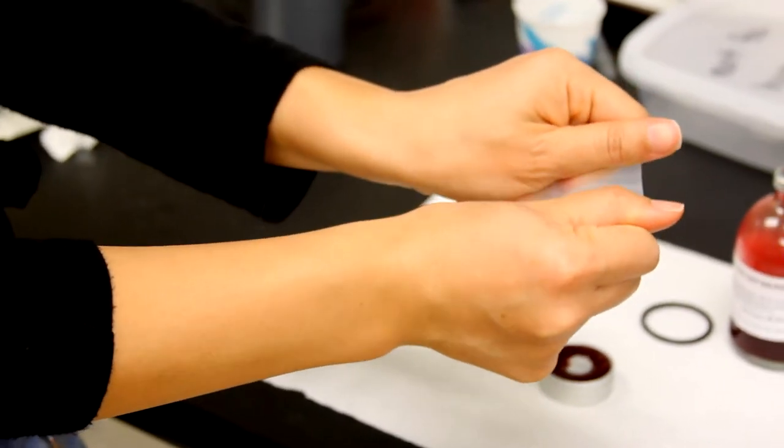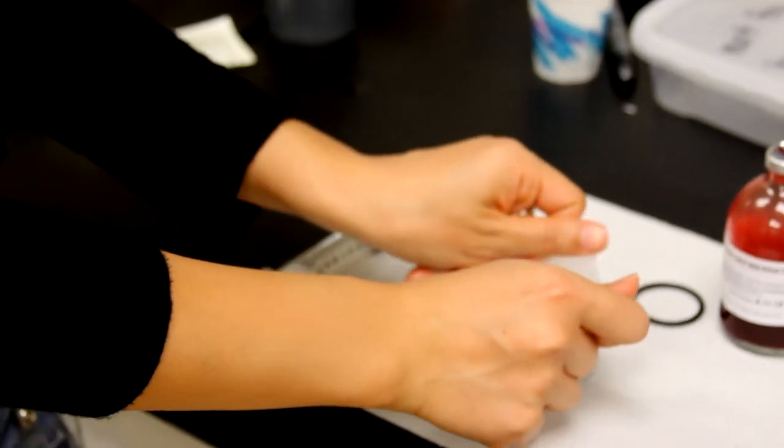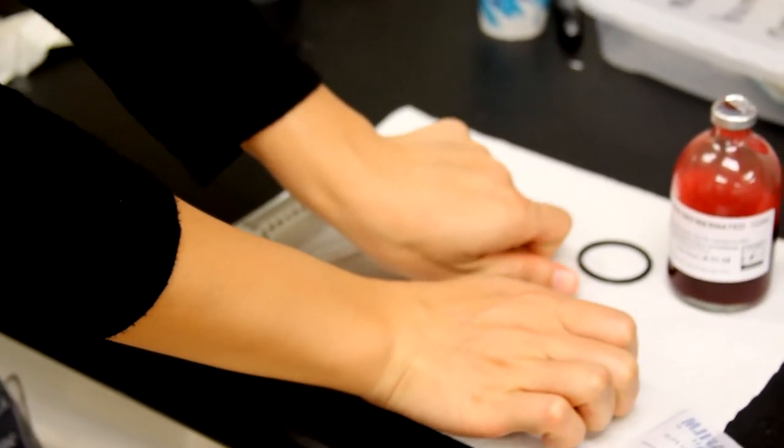Then stretch the parafilm over the reservoir with the human scented side facing out. Make sure not to stretch too thin as it can melt or tear when warmed up.